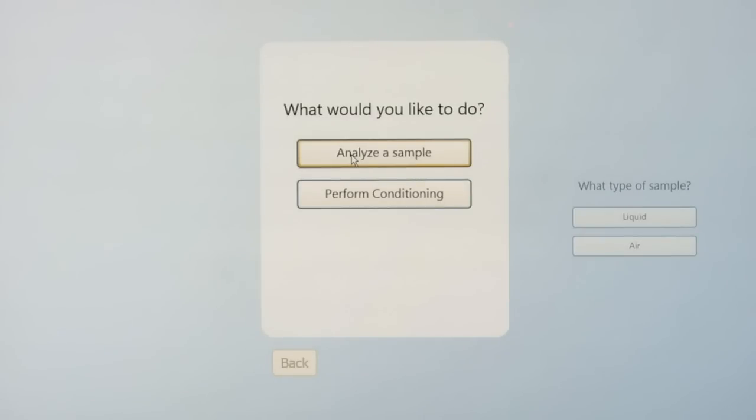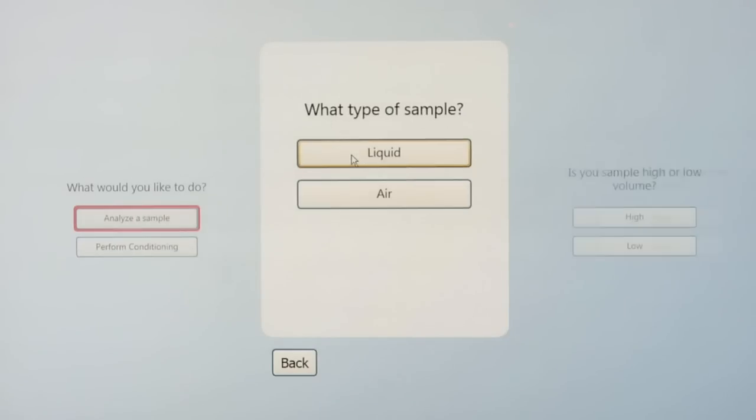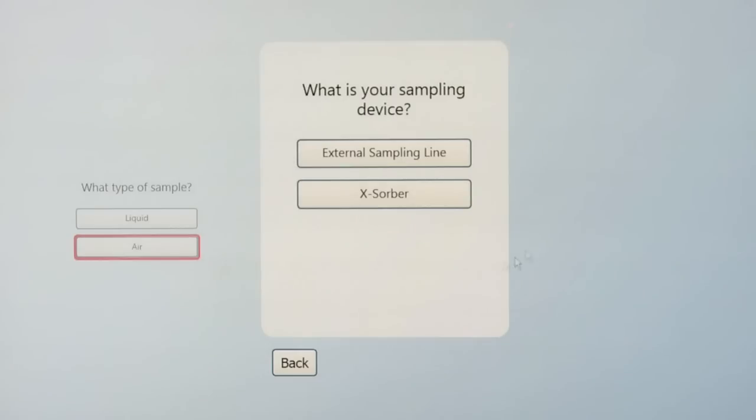Today I used the Xorber, so I'm going to select air. Next, it's asking what was my sampling device. We used the Xorber, and I'm going to select tube A because that's the tube we collected the sample on.